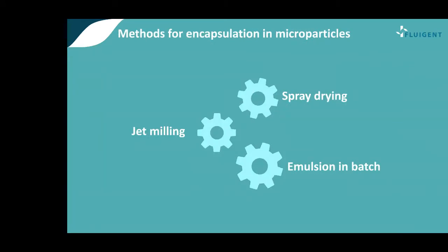But how do we make this microparticle? How do we encapsulate drugs inside microparticle? There are many methods to produce microparticle, such as spray drying and jet milling, but I would like today to focus on the emulsion in batch because this is the most widespread method.